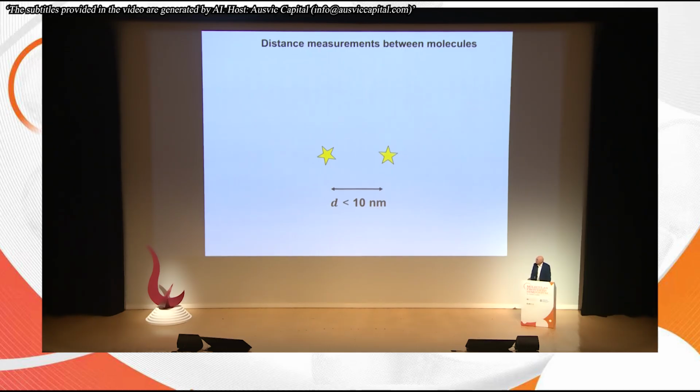I've been working, as you know, on resolution for quite some time, and there were papers 3-4 years back that said, if you're below 10 nanometers, then this whole super resolution thing will not work anymore because that's too close of a distance. It's true that if you want to measure the distances between two fluorophores, what people usually thought about was to use a methodology called FRET. They said, okay, if I want to know if two proteins colocalize that have two fluorophores attached to them, I'm using FRET. Now, FRET is a method that doesn't give you the distance directly, it gives you that distance indirectly. So you have two different types of fluorophores, a so-called donor that has shorter absorption and emission wavelengths, then the energy is directly transferred to a so-called acceptor that emits at a longer wavelength.